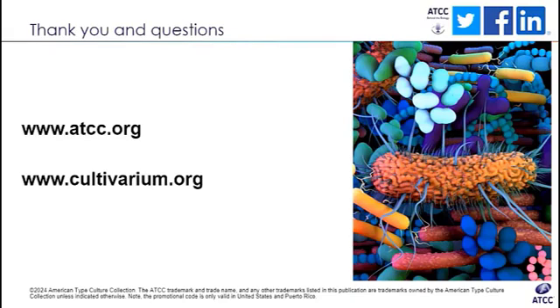Here's another question. Does the search tool you showed only work on Cultivarium's data? The advanced search tool is a natural language search, and it works with all the data that we host in the portal, and not just the data that we generate.